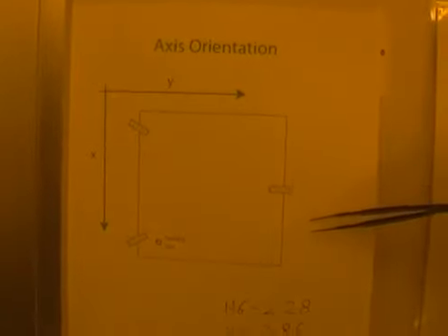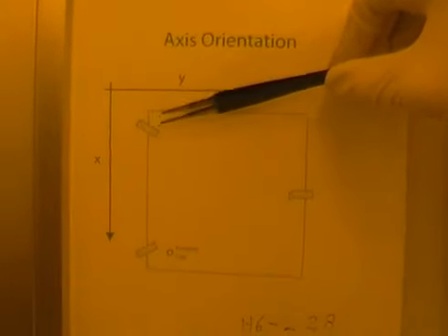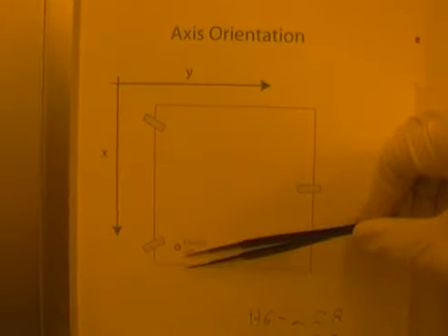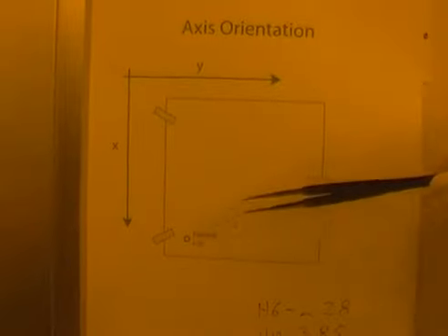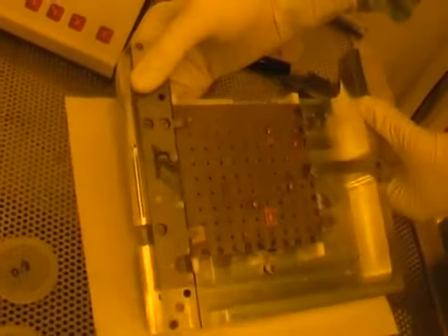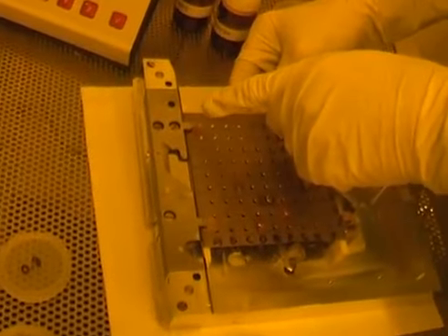If we look at the wall, we can see the axis orientation, and we can see that the bottom left is actually at the top left as you look at it, but only as you look at it with the Faraday cup in that position, which means I would have to turn this to 180 degrees and then the top left corner would be here.